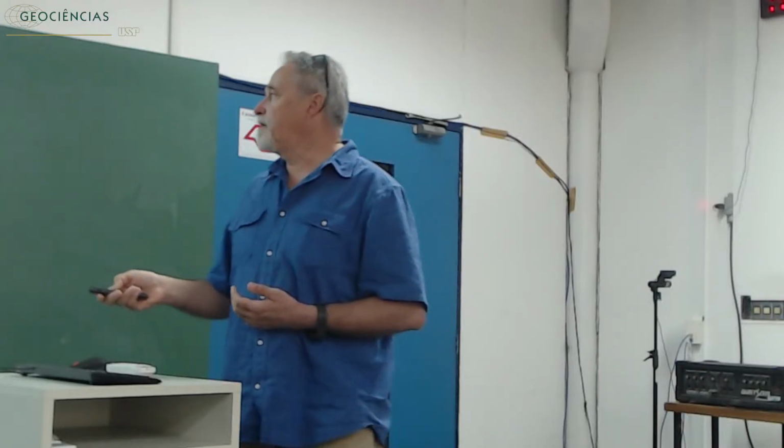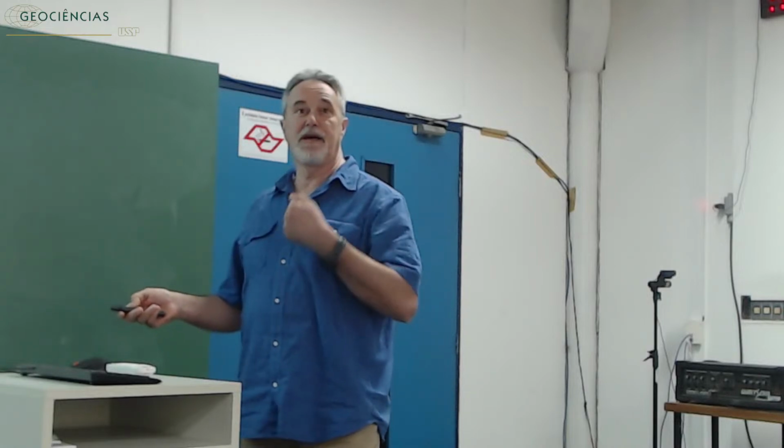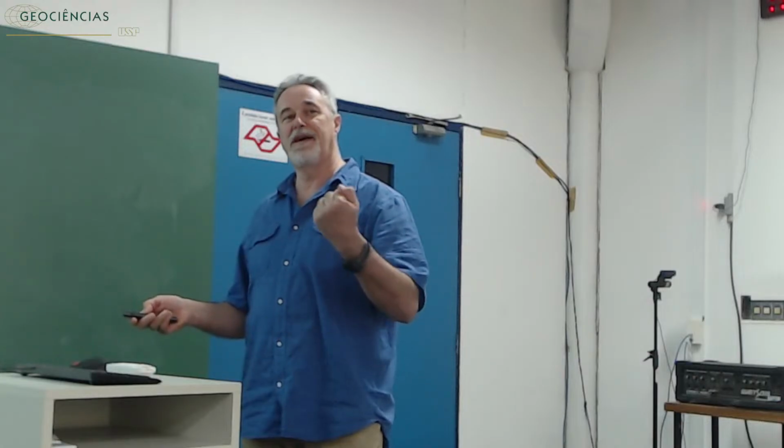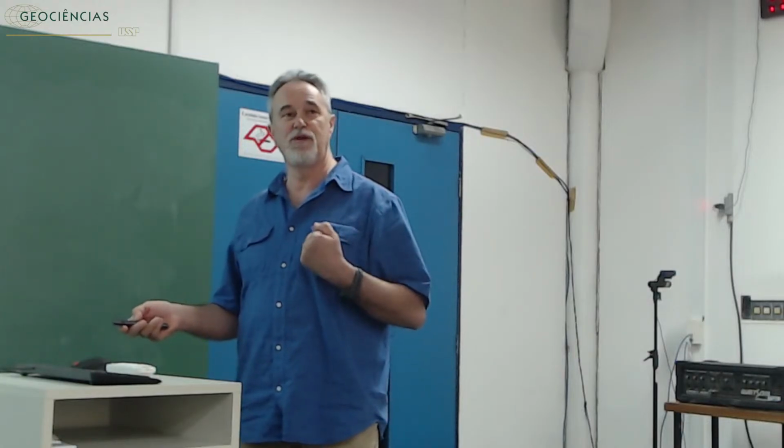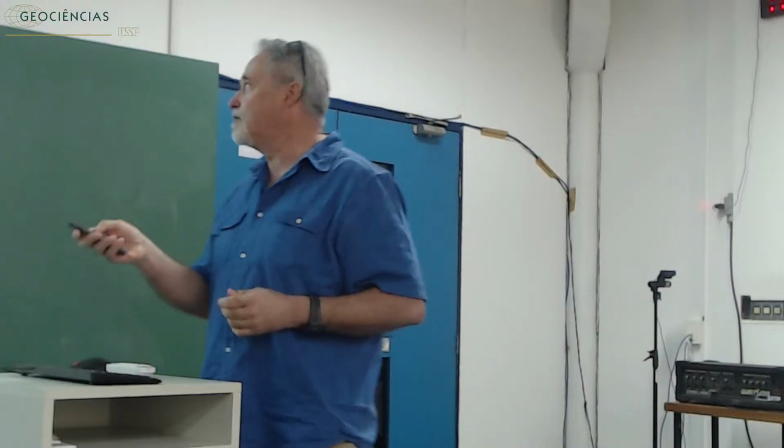Why? Our explanation is that in order to introduce a trivalent cation replacing a divalent iron, we have to introduce beforehand a vacancy in the lithium M1 site, and the M1 chain with some vacancy maybe helps the diffusion of lithium along the chain.